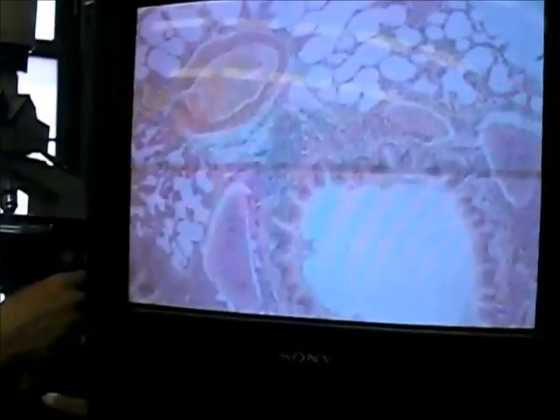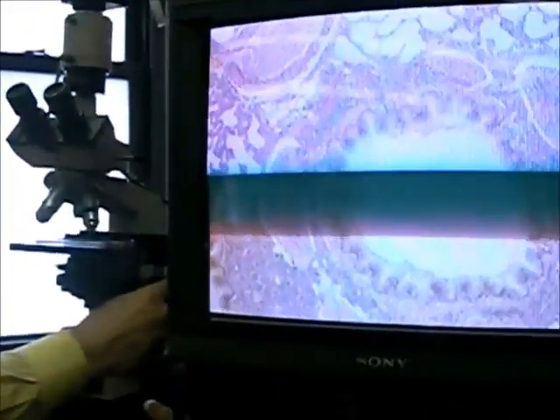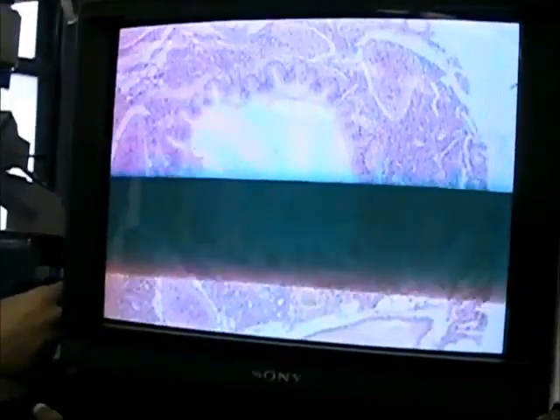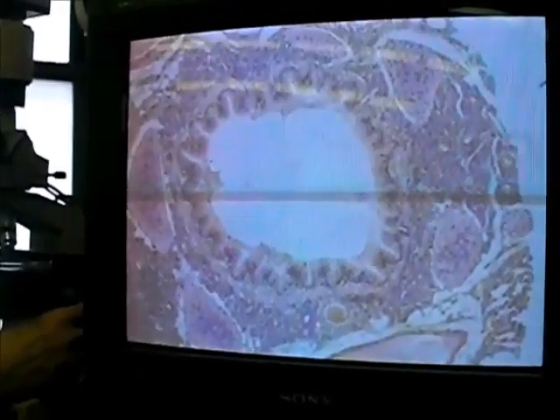How do you know if it's a blood vessel? It has blood in it. So you know what a blood smear looks like. Arteries have a thicker wall. It can be difficult to tell arteries from veins if you don't see the context of the other. Now, an air pipe has air in it, which stains what color? None, right? It's air, it's invisible. Except maybe in Mexico City or Los Angeles at certain times of the day.